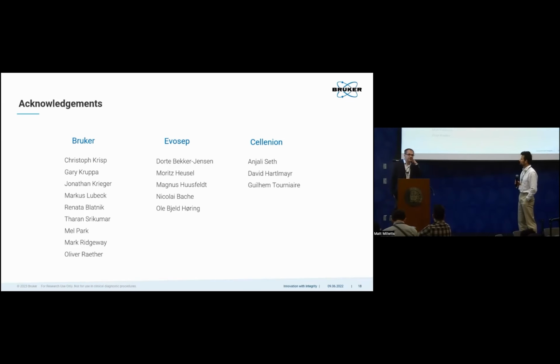That's a great question. I think there'd be benefits from improving the resolution of ion mobility generally. I'm very proud to say I have 200 resolution, but that's pretty embarrassing when we think about mass spectrometry, when we're talking 50 to 100, 200,000 plus. Improvements there will certainly help to further resolve a lot of the overlapping species.